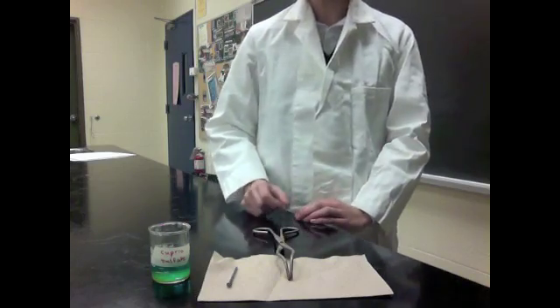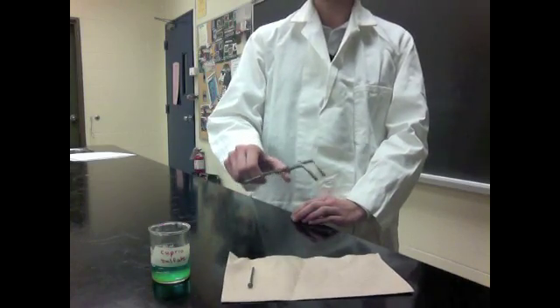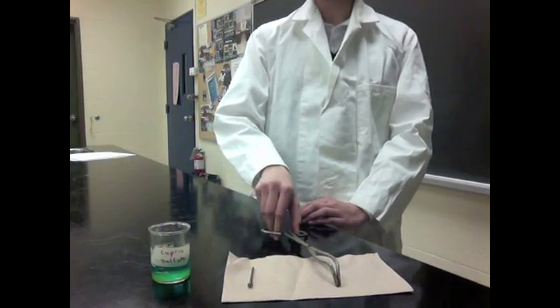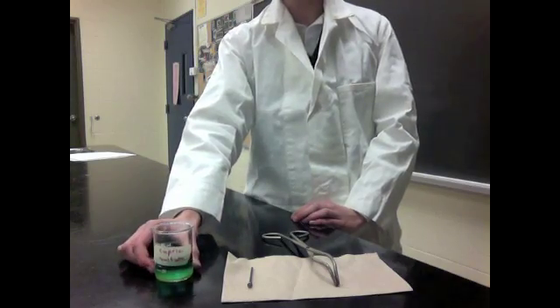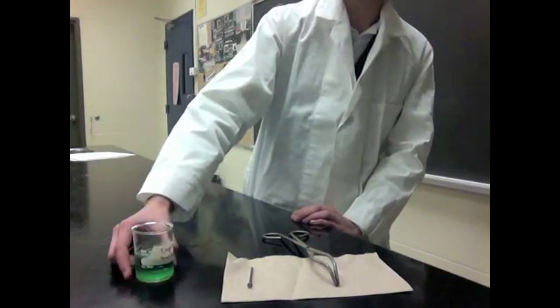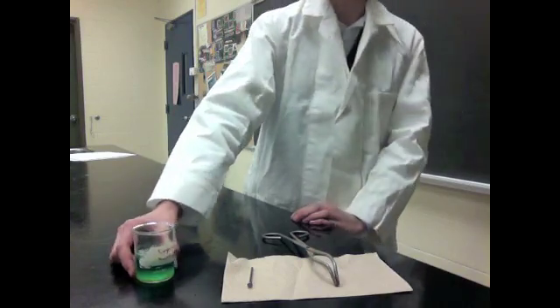And we are also going to need a pair of tongs, we're going to need an iron nail, and your teacher will supply you with a beaker full of cupric sulfate.